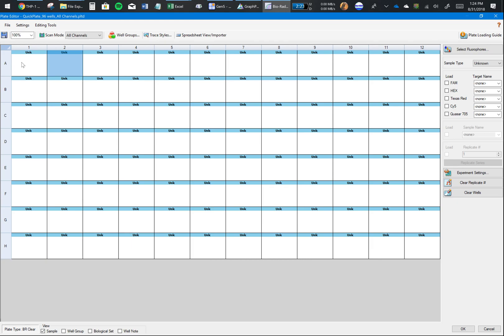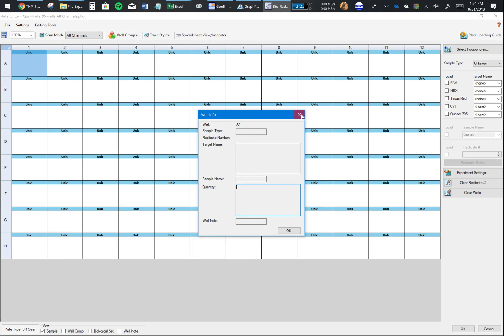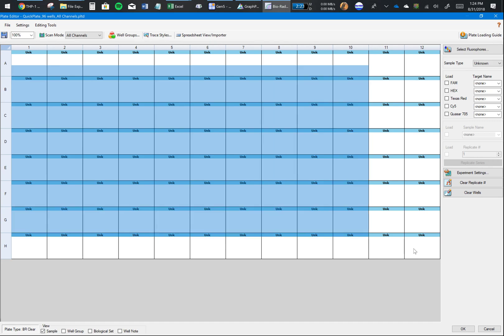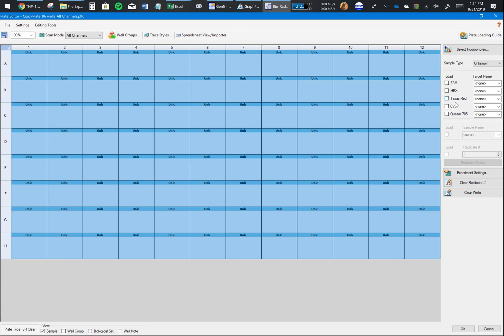If you have a no reverse transcriptase control (NRT), you could also put that. I would just assume everything is Unknown for me right now. That's the first part - you select your sample type.